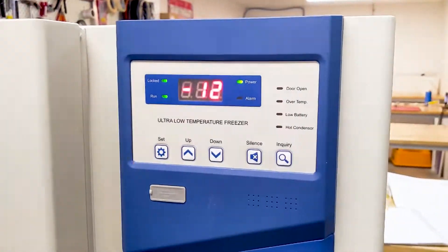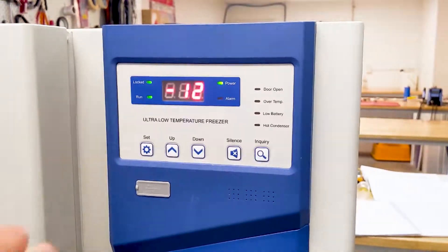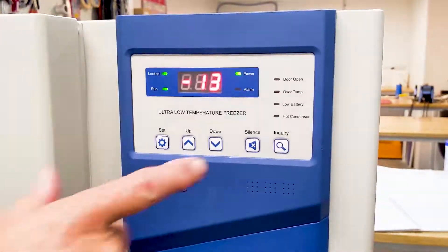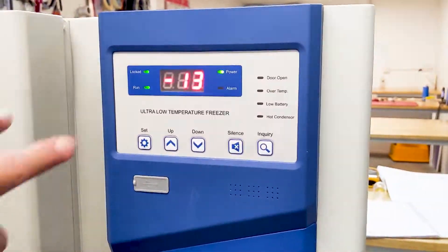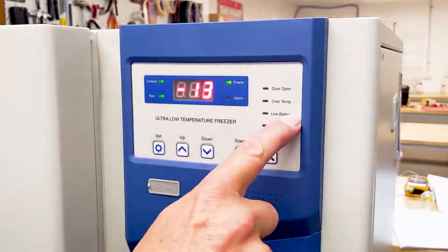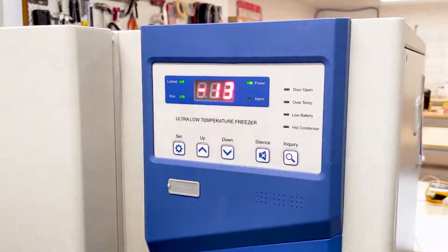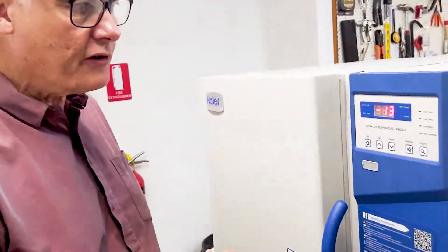It does have four built-in alarms. First, a door alarm which will activate if the door has been left open for more than five minutes. Second, an over-temperature alarm — if it's warmer than the set temperature, the degree of difference between the alarm going off and the set temperature is adjustable as a user setting. Third, a low battery alarm.